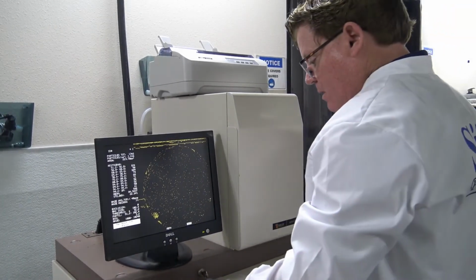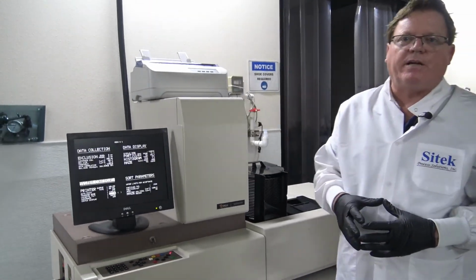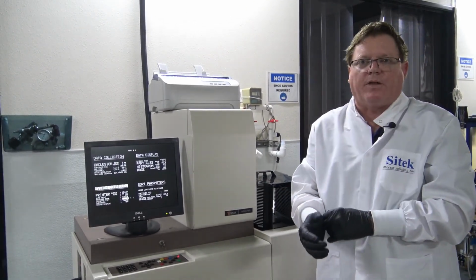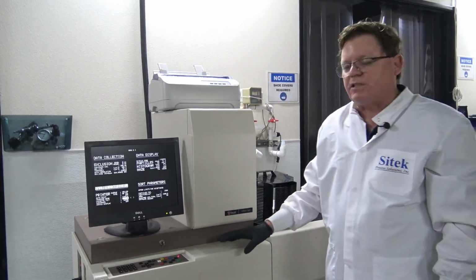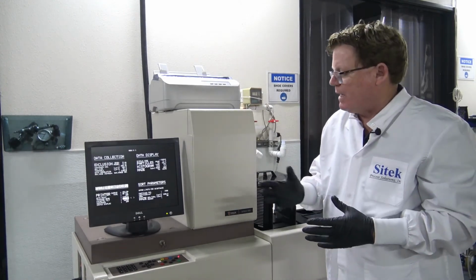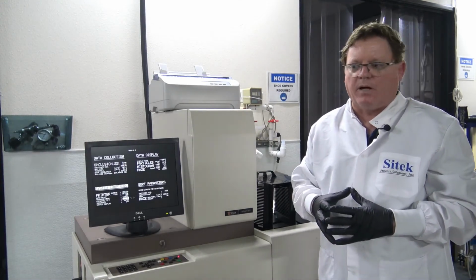Alrighty, so I'll go back to my main screen. So that will finish the demonstration of the Tencor 5500 Surfscan particle counter. We will supply a manual. The manual also has the manual for this printer, and there's lots of other functions that the customer can go with on setting up the wafer ID, again picking for different slots and so forth, but that's all in the manual, and that's part of the detailed training the customer's already gone through.